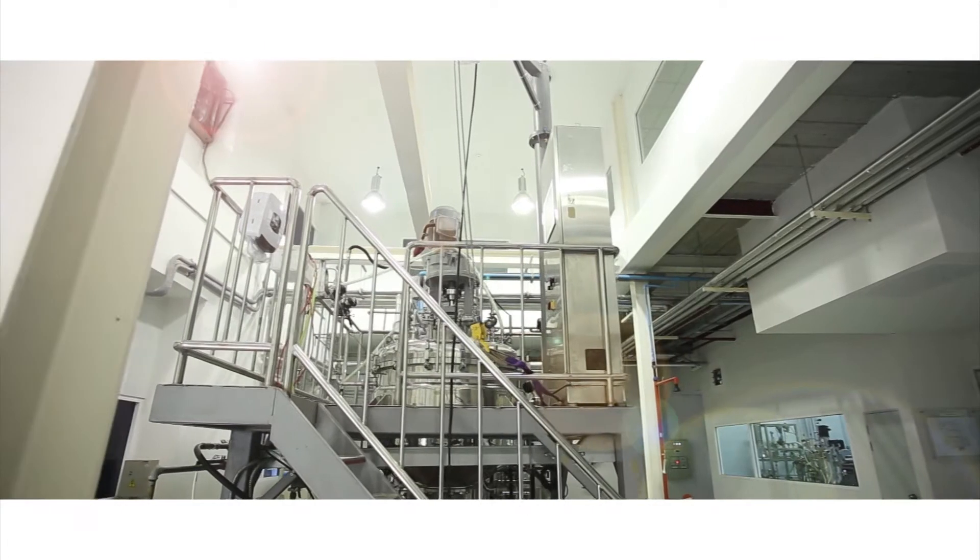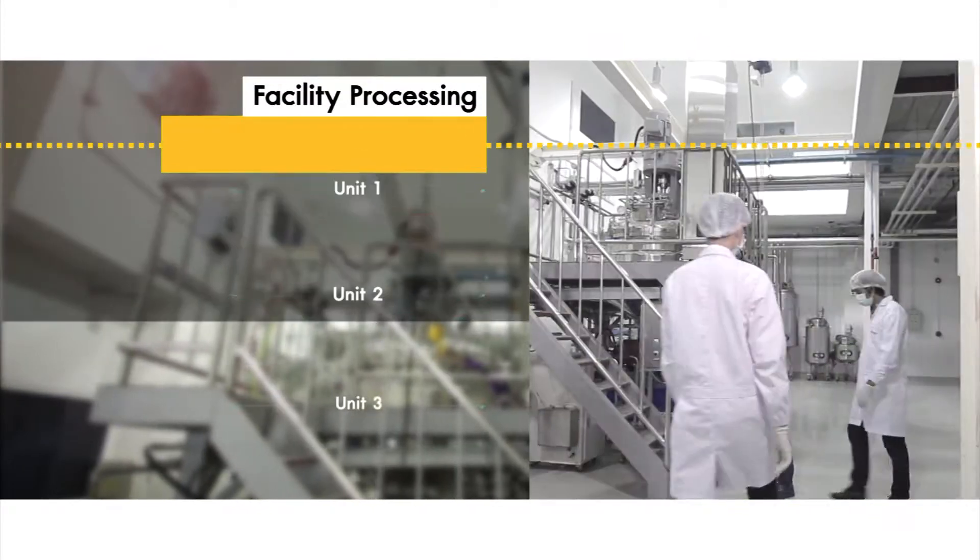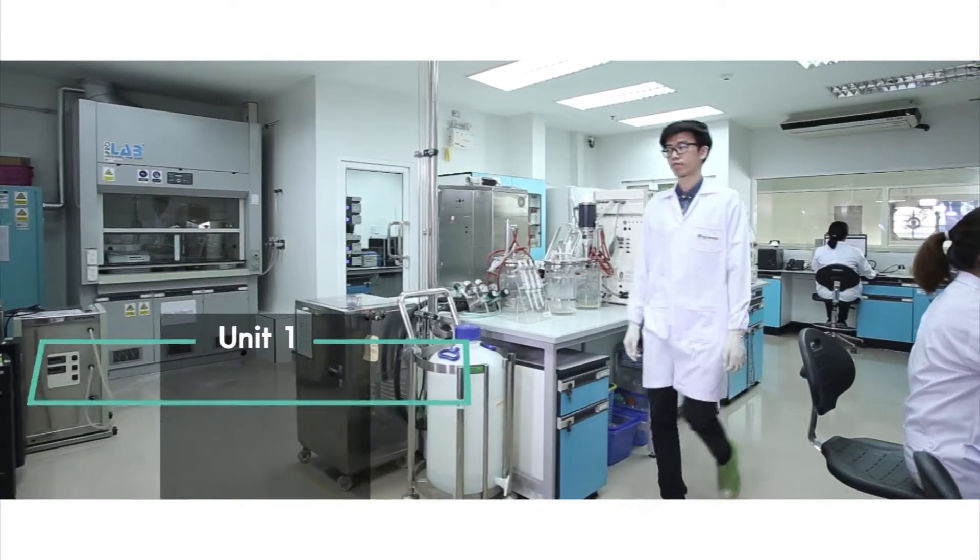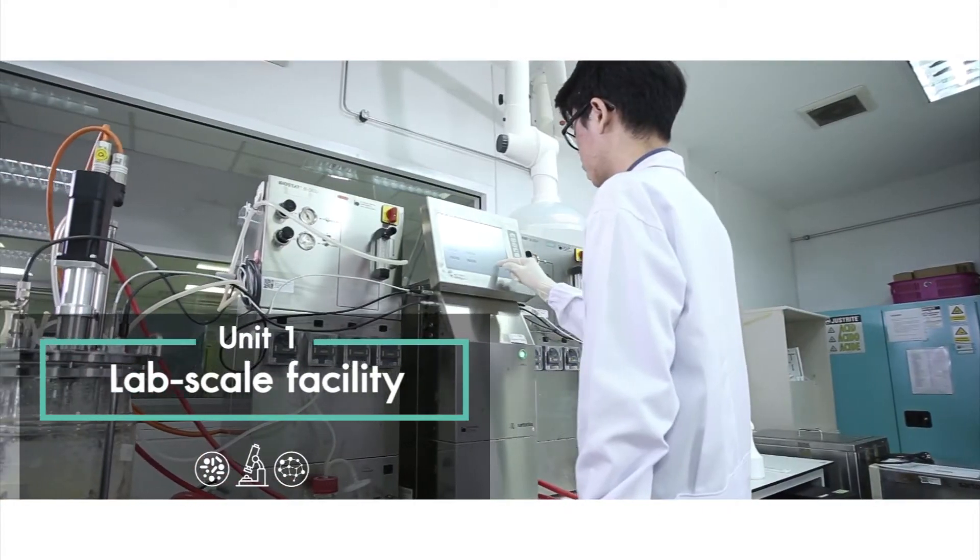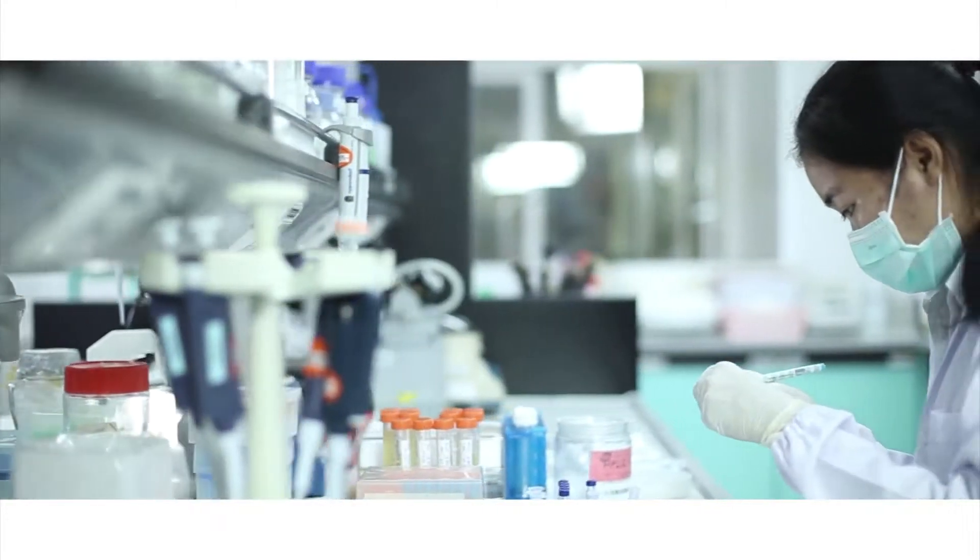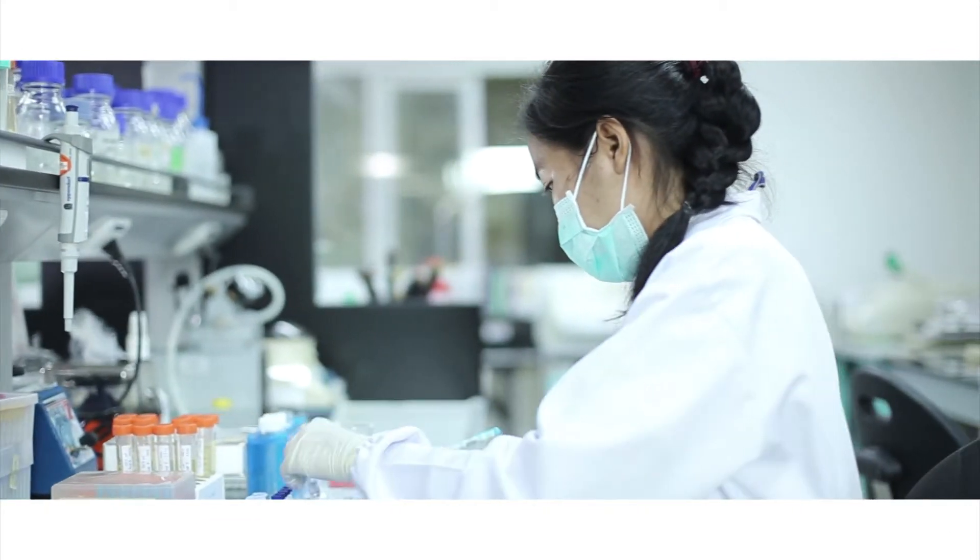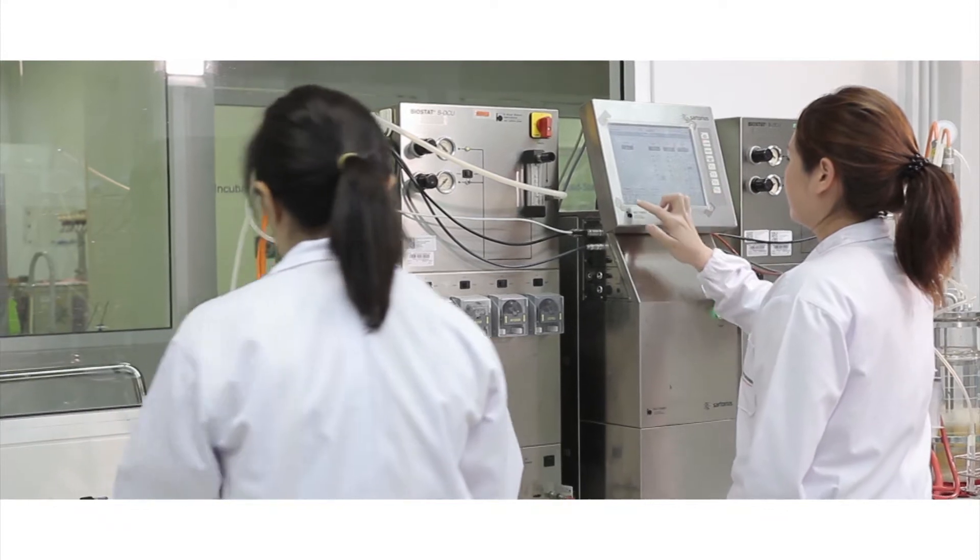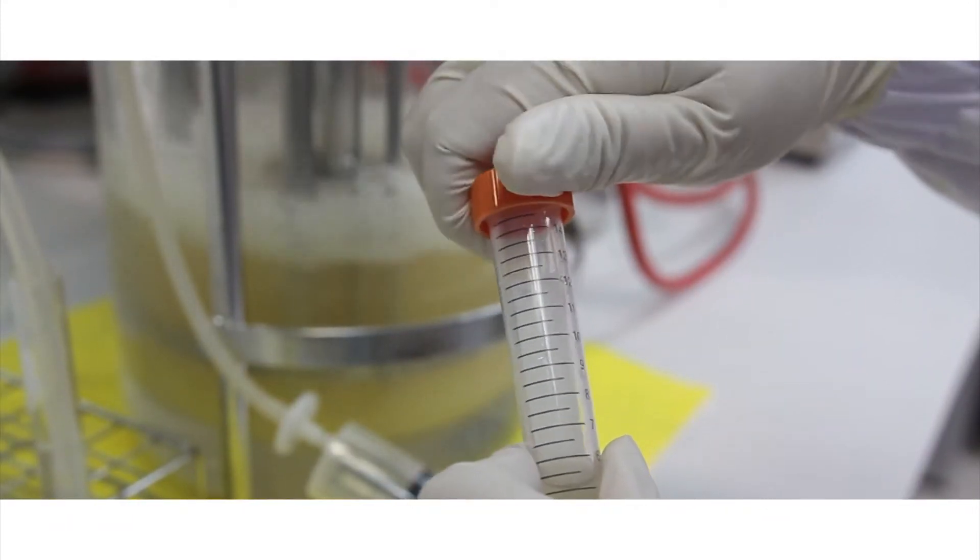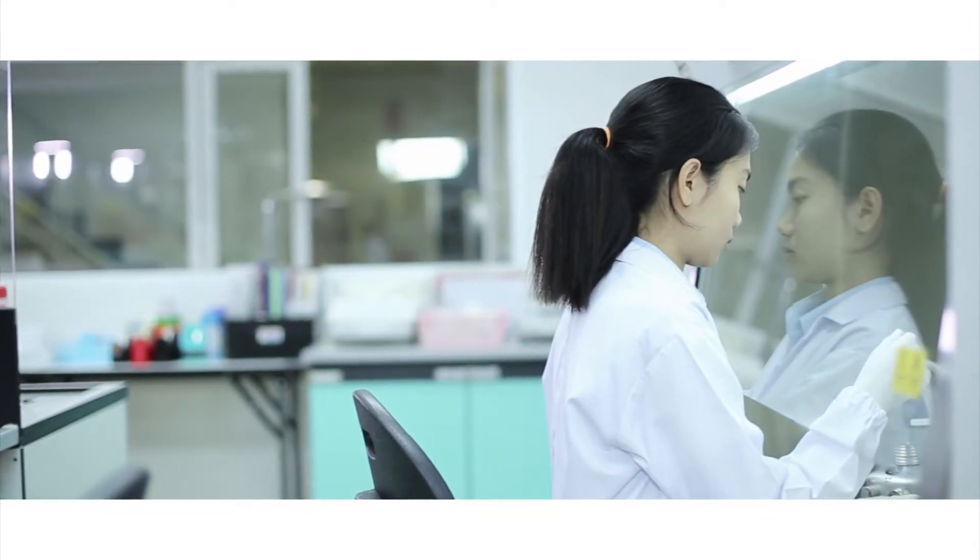Biotech Bioprocessing Facility consists of three operating units. Unit 1: Lab Scale Facility. This laboratory undergoes R&D and process improvement for production of high-value products derived from microbes such as yeast, fungi, and bacteria by fermentation technologies.